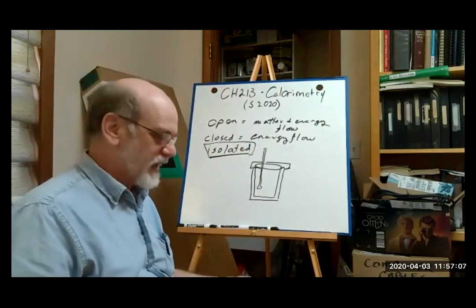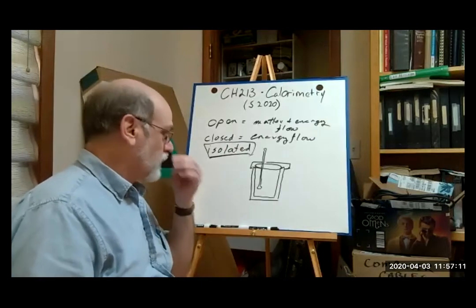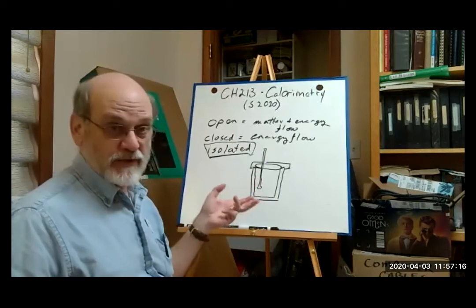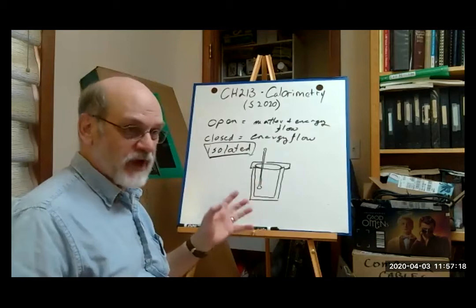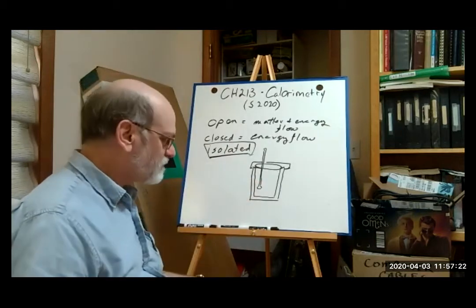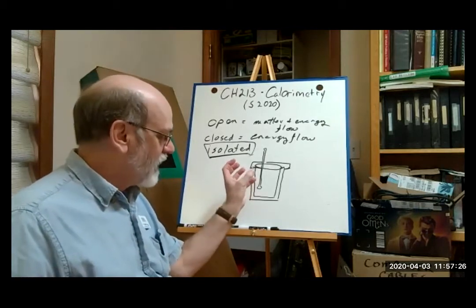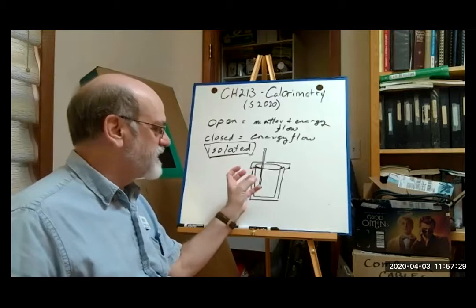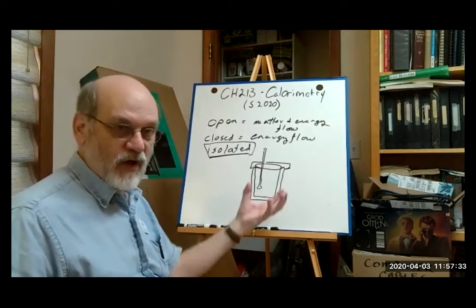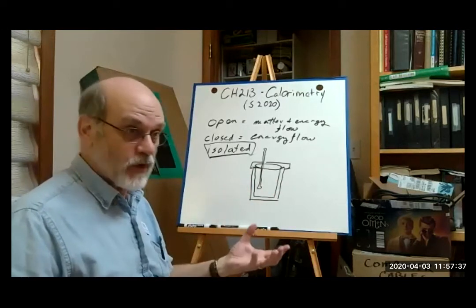It would corrode over time, and it just created too much trouble. So what you would normally do in a hands-on experiment is use your thermometer to stir the mixture. And if you're careful, they're robust enough, you can stir with your thermometer. The other thing that does is it limits the ability of the calorimeter itself to absorb heat or evolve heat, because the calorimeter has a heat capacity of its own.